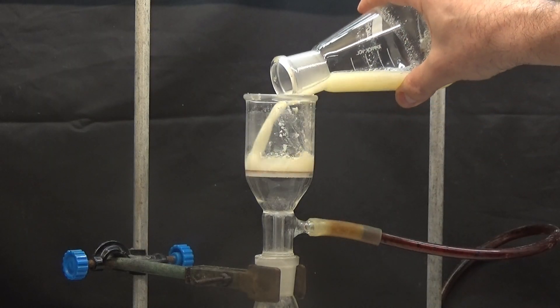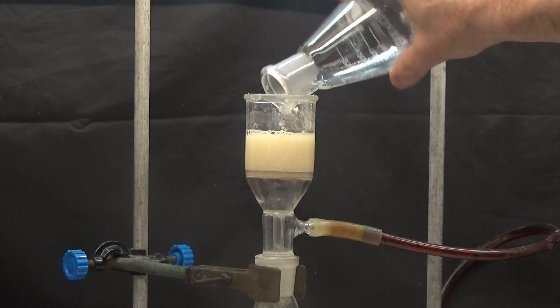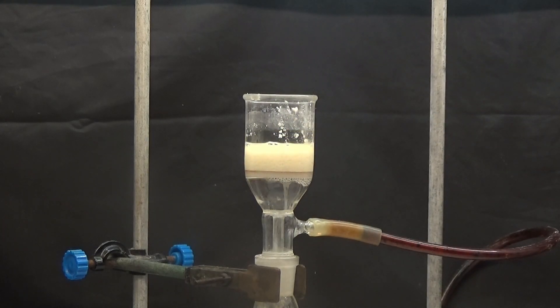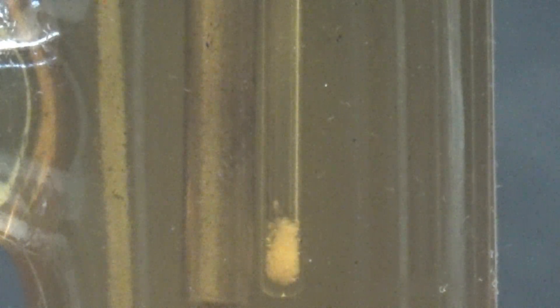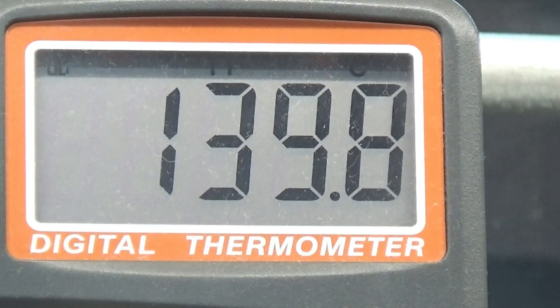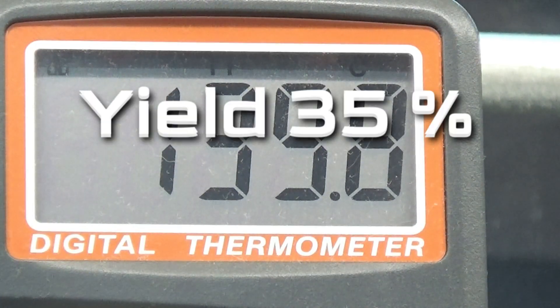The filtered toluene was evaporated to half its volume and allowed to cool. Crystals with a melting point of 138 degrees were obtained, a value very close to that of pure orthochlorobenzoic acid. The yield of this operation with respect to chlorotoluene was 35%.